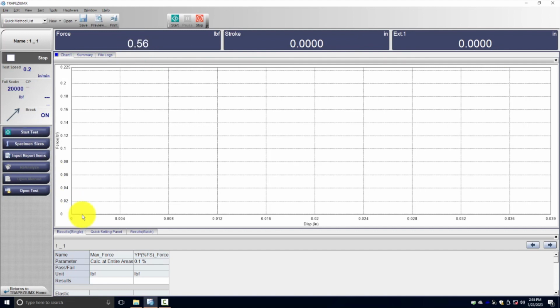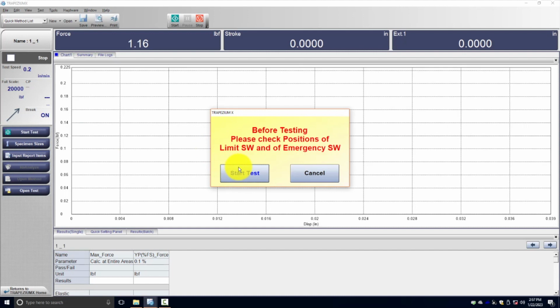We're going to be able to start the test, and we're going to watch the plot, and it will automatically scale, showing us that data. So let's come in here and start this. We're going to hit start. Now you should at this point have the safety door all the way down. You need to double check and make sure that the controller is off the jog mode, that it doesn't have a light on, or you will get error messages, and you're going to have to go do those and then just reset the error messages.